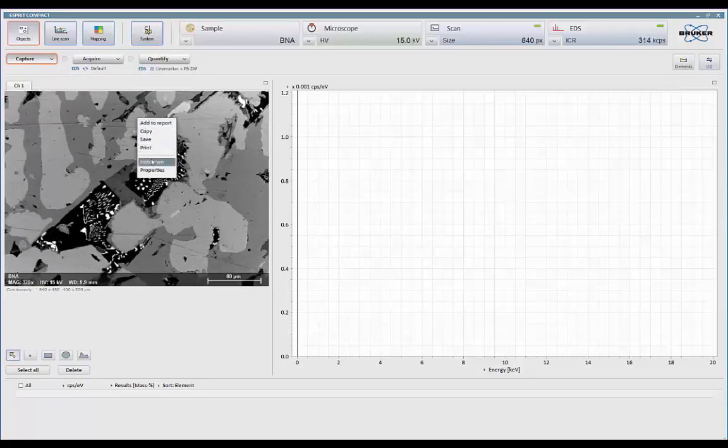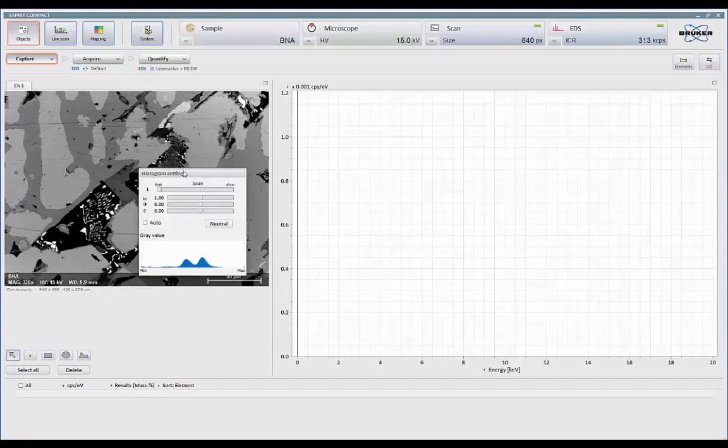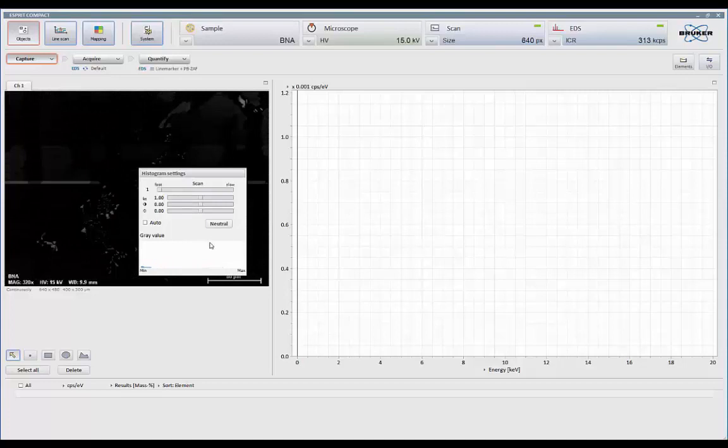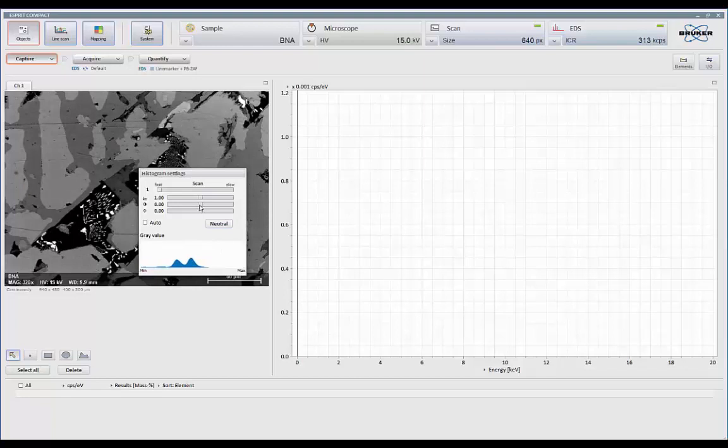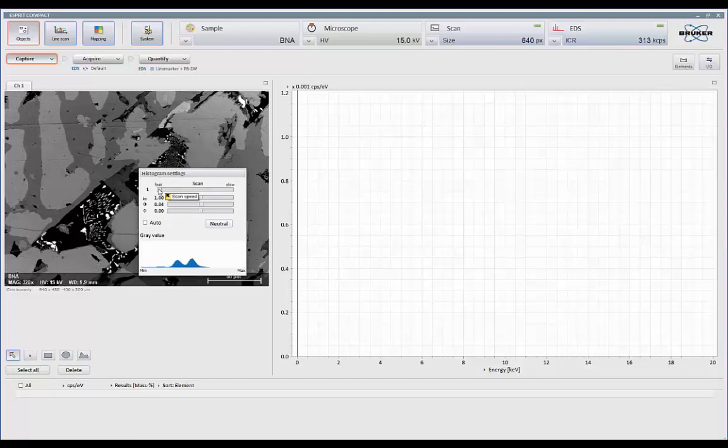If I want to make any adjustments, I can bring up the histogram display. So now I have a live histogram that I can either use the controls from the microscope to optimize the signal, or I can control the signal through here as well. So I have contrast, brightness, gamma. I can even increase the frame average, line averaging if I wish at this point.